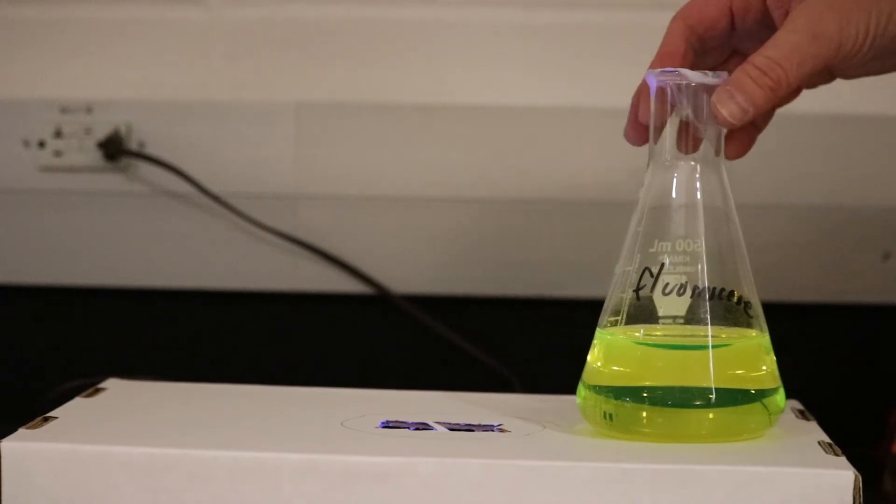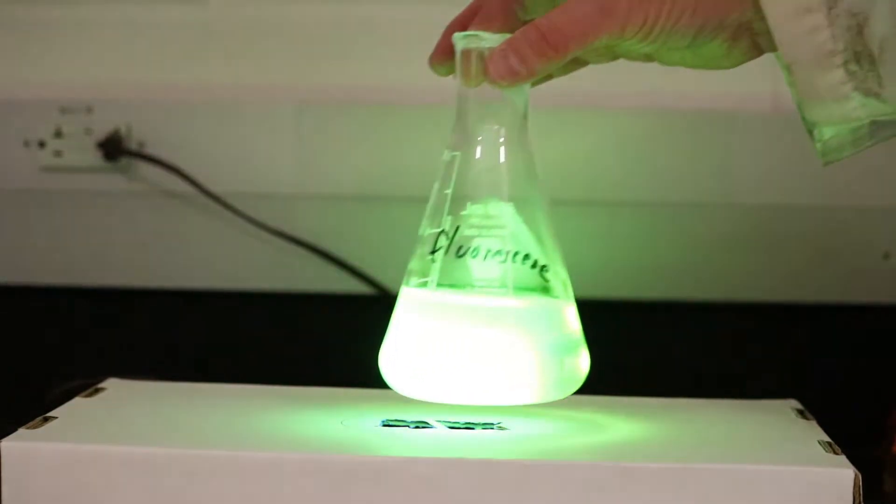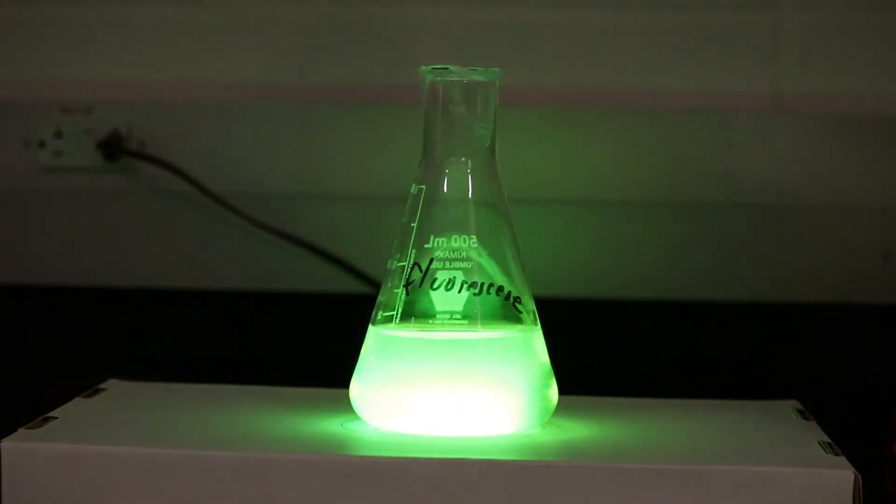We're going to start with fluorescein. Fluorescein as you can see is sort of a yellowish color, but when we expose it to ultraviolet light it gives us this nice bright green color.